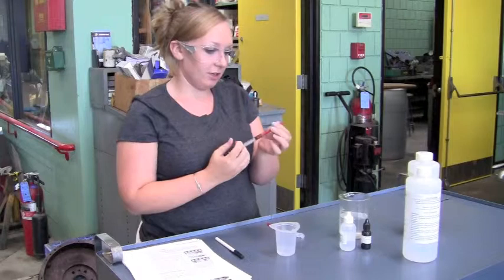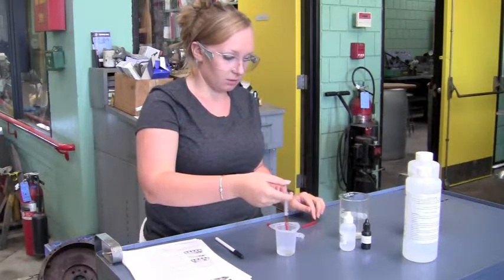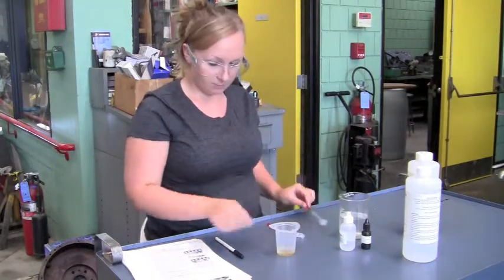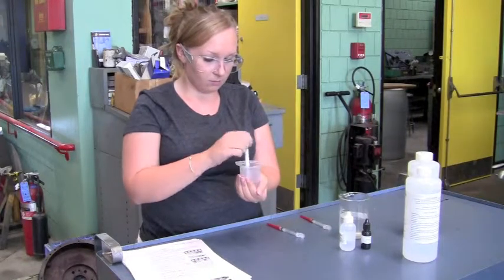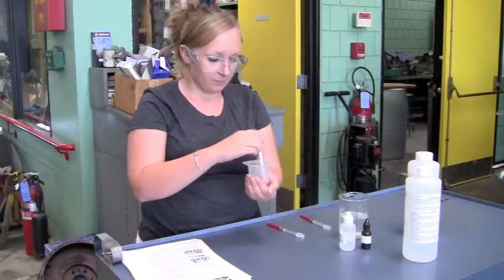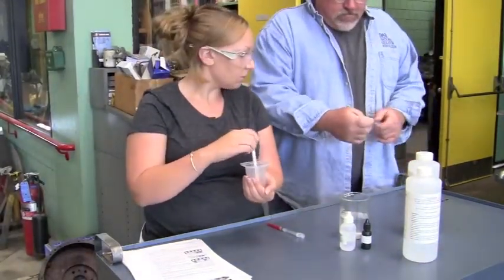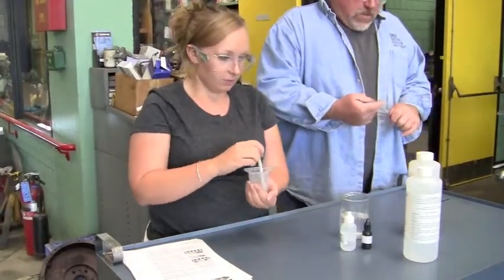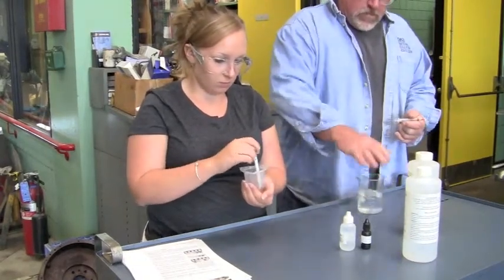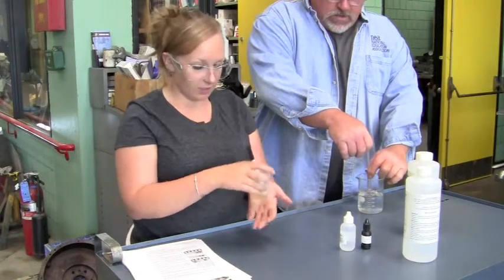Then we add one milliliter of oil that we're going to use, mix that up and warm it up with your hand. We need to add two drops of phenolphthalein solution.